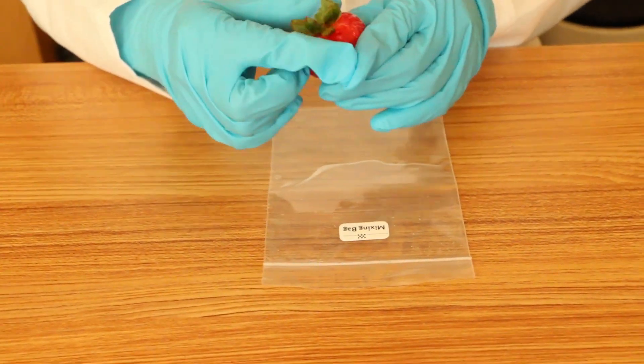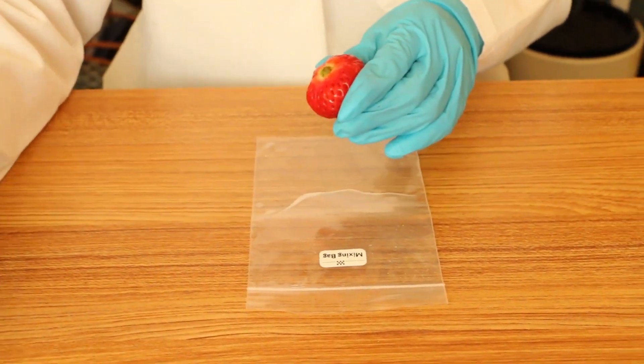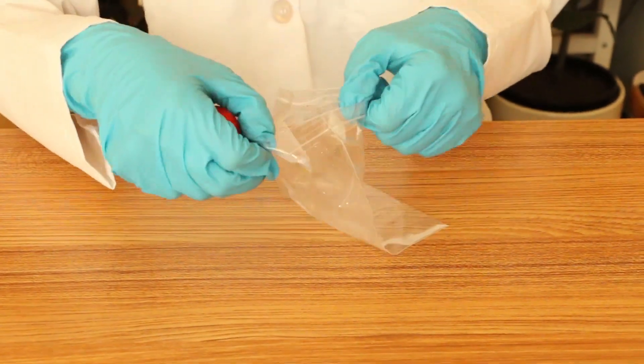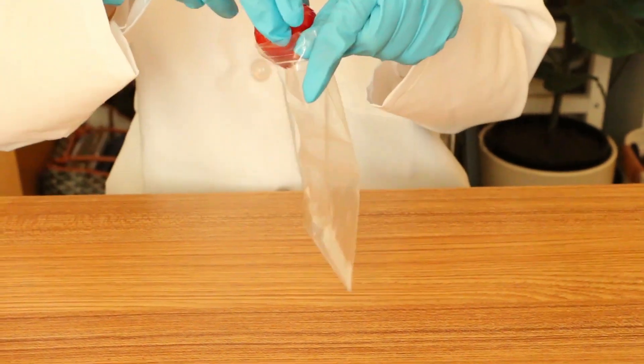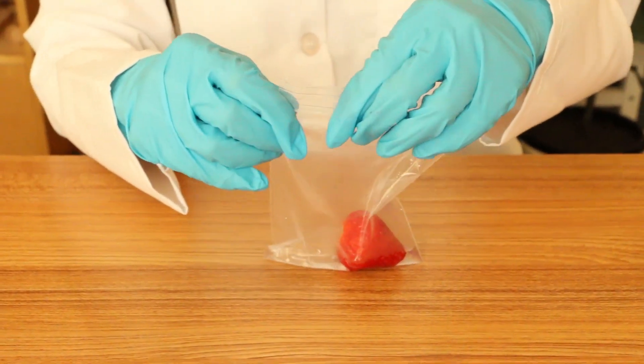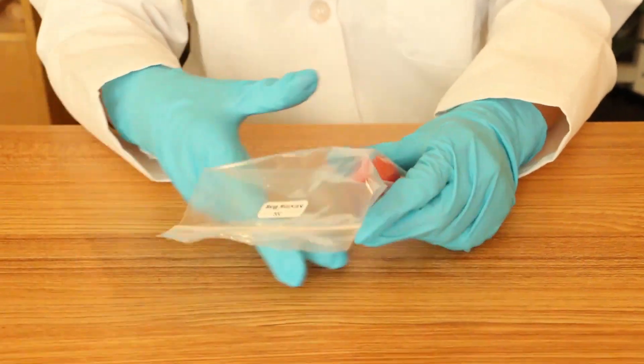Now for the fun part — we're going to take this strawberry, which contains millions of individual cells, and break up those cells in the saline solution. We'll just remove the top, throw it into our saline solution, and start mashing it up.